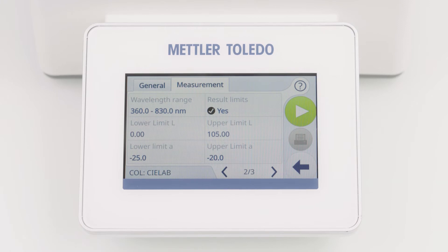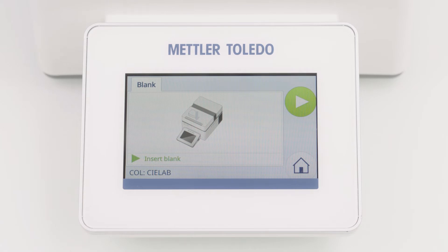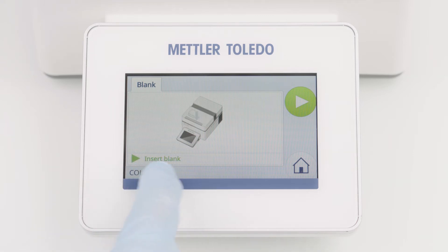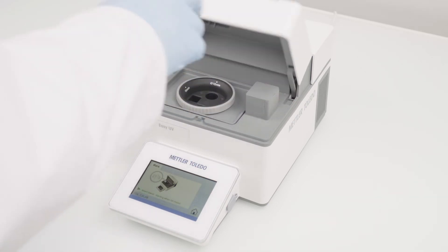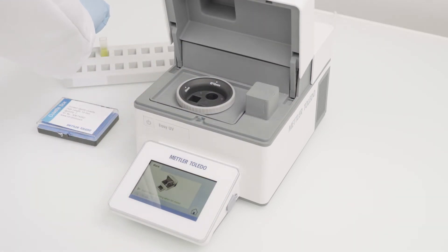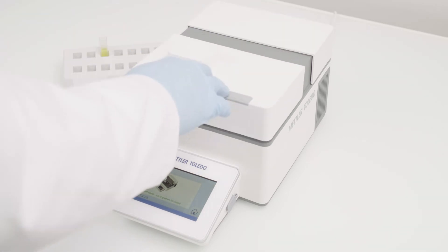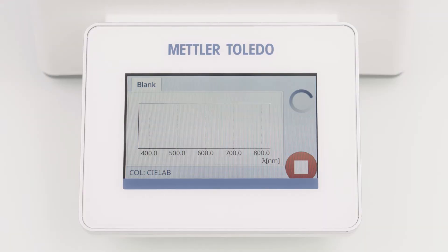Now the method is completely defined and we are ready to perform the measurement. To start the method, I am clicking the green start button. The instrument now guides me through the whole workflow. First, I need to perform the blank measurement. I follow the instructions shown on the screen and press the lid to open.